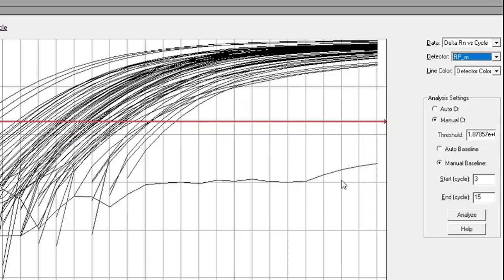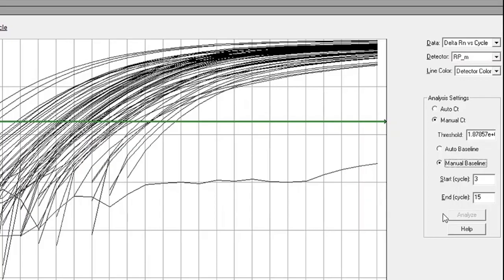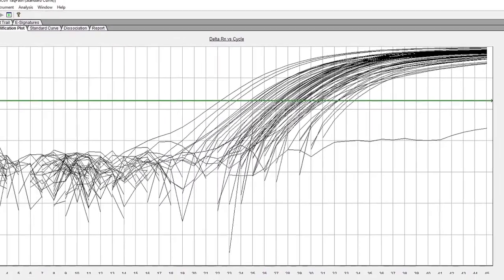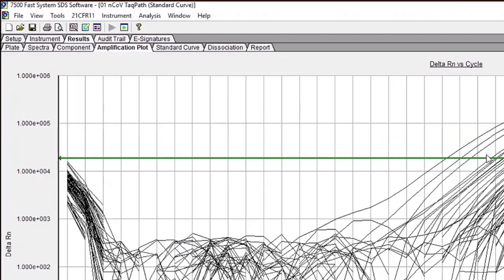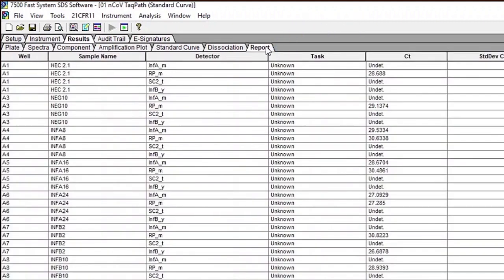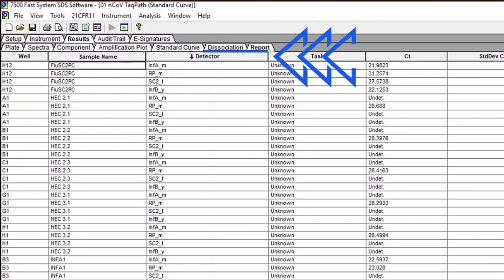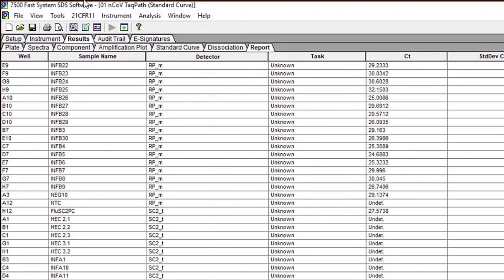At this point, all four targets of the Flu SC-2 multiplex will have independent thresholds set. Once these thresholds are set, select the Report tab above the graph to display the CT values. To filter the report by sample name, click on Sample Name at the top of the table. To filter by detector, click on Detector. Be sure to save the data file by clicking File, then Save.